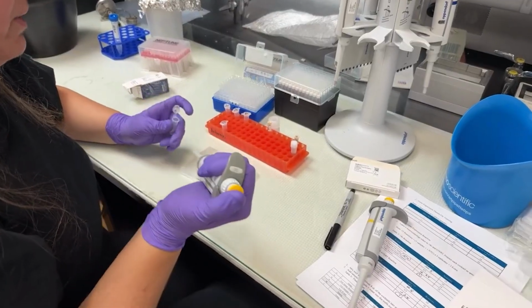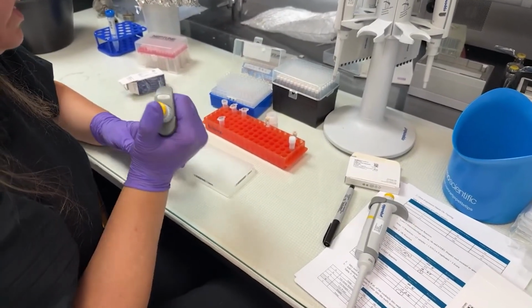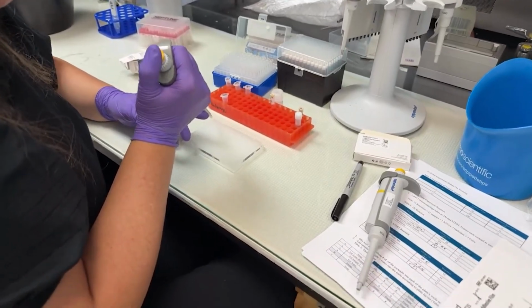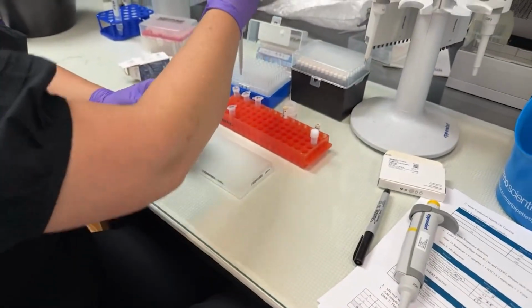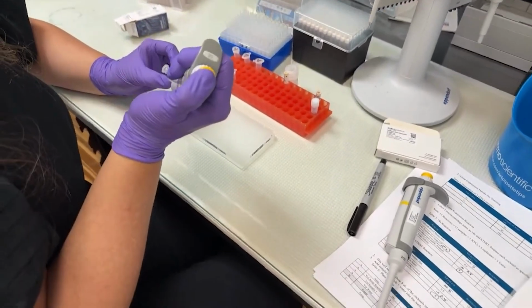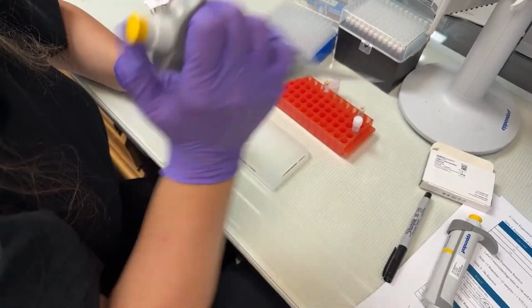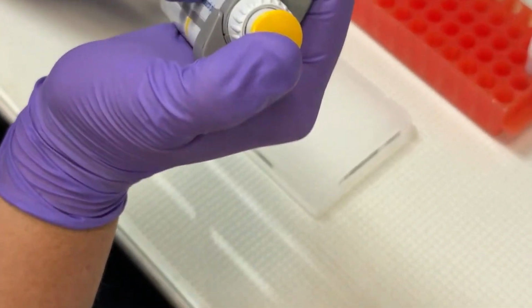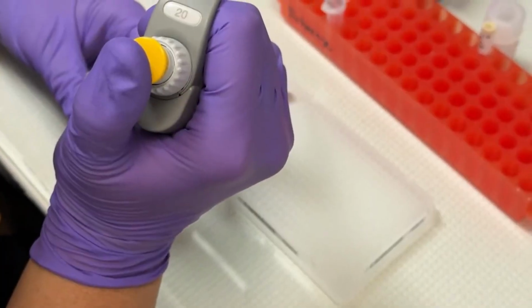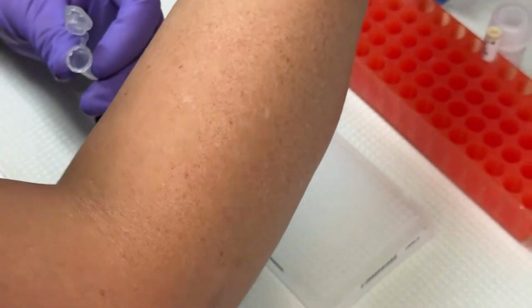So I'm going to put 8 microliters into each well, which I know everything is clear and white, and it's hard to see. So this is A1, A2, A3 with our 18S assay mix that we made.